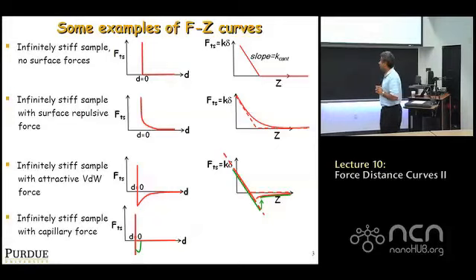Do you guys know why when you come in there's going to be a snap in and there's going to be a multi-valued curve when you come in and move away, FZ? Well, you need to look at the lecture again properly. We really can't go forward without this. But essentially, let me just give you a summary, and please go back to the lecture, watch it again if you haven't. Basically, remember what we're trying to do.